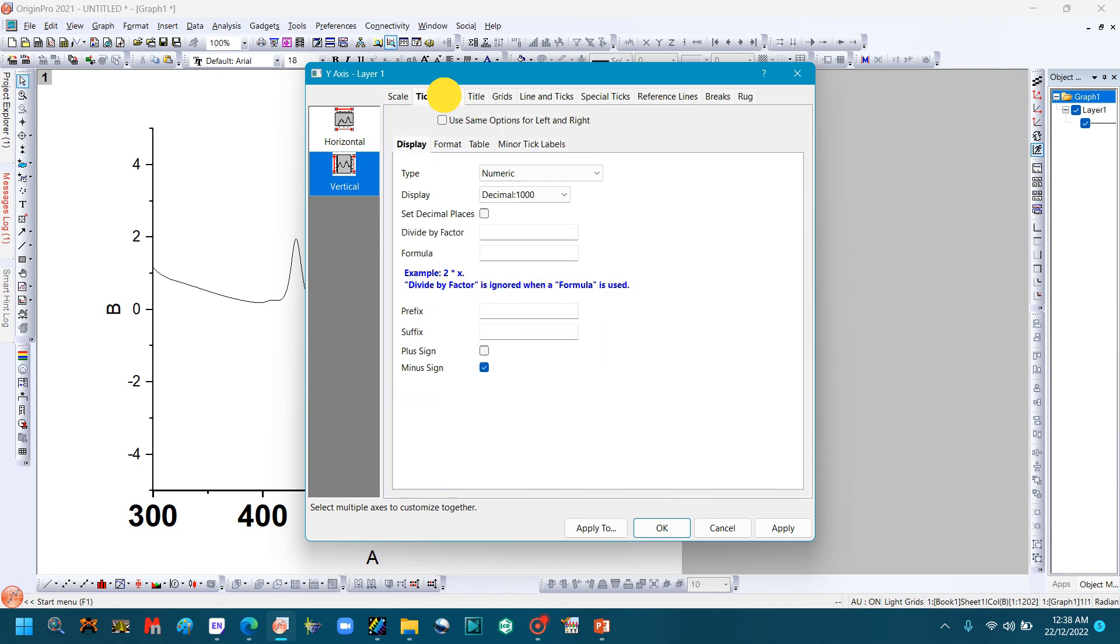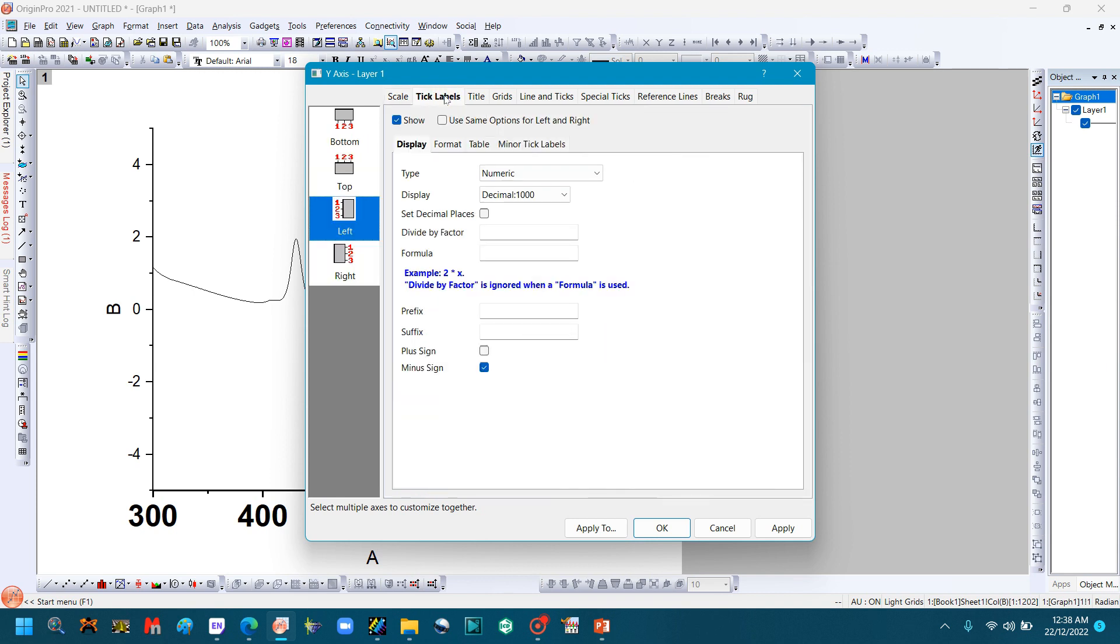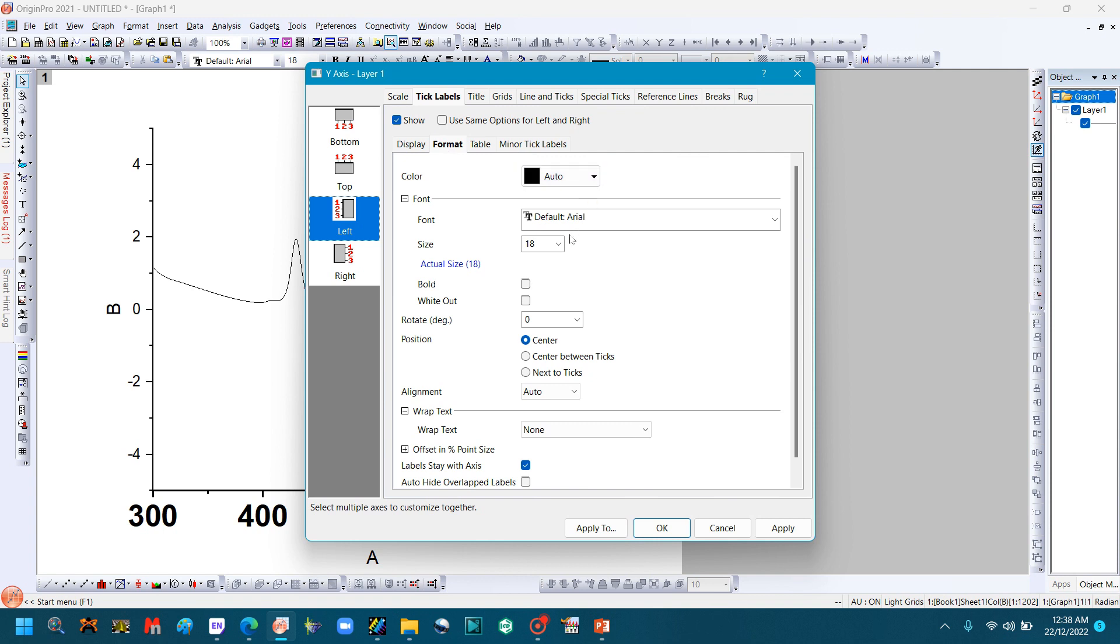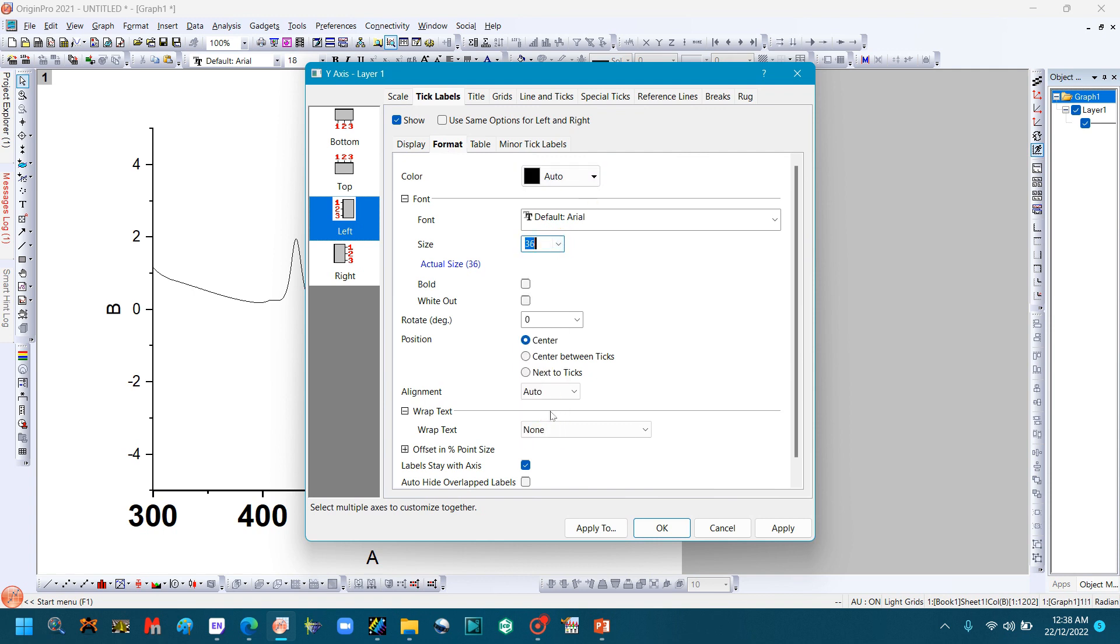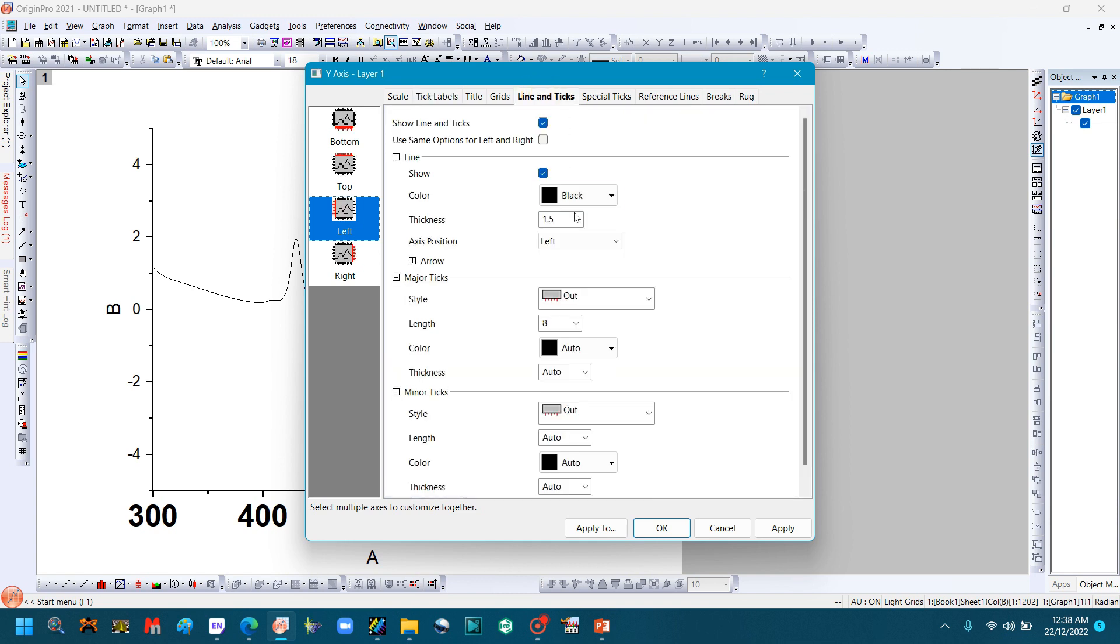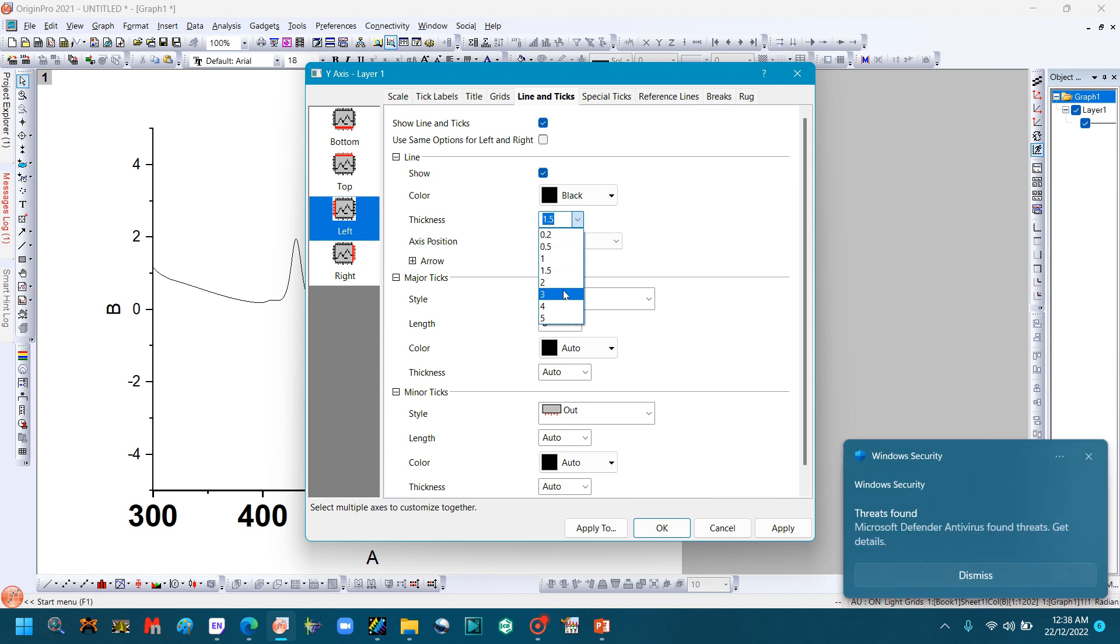Click Labels, click Format, change the font size, change the thickness, and click OK.